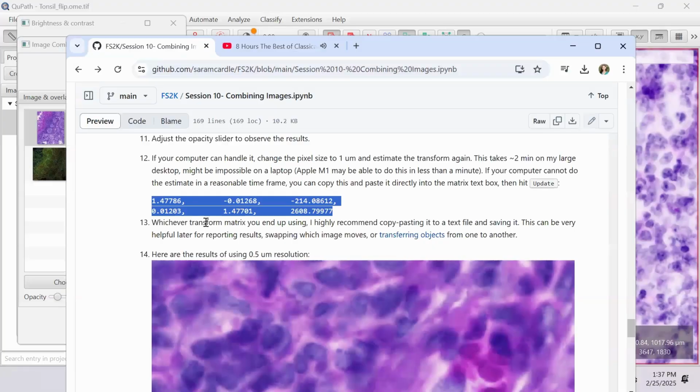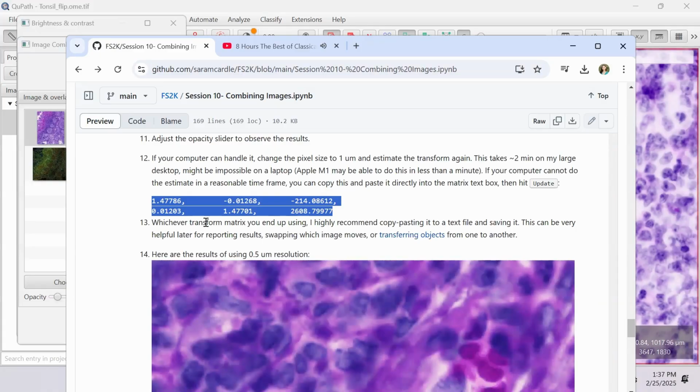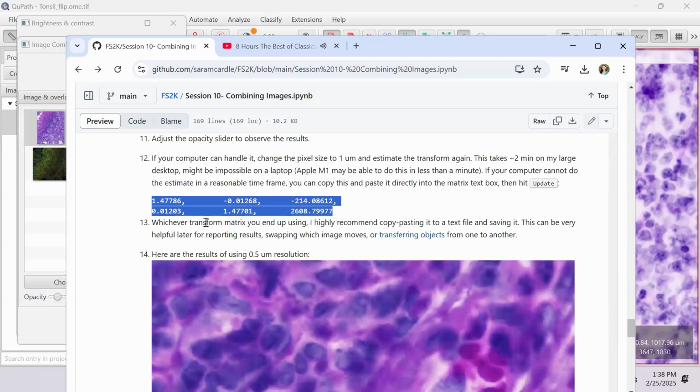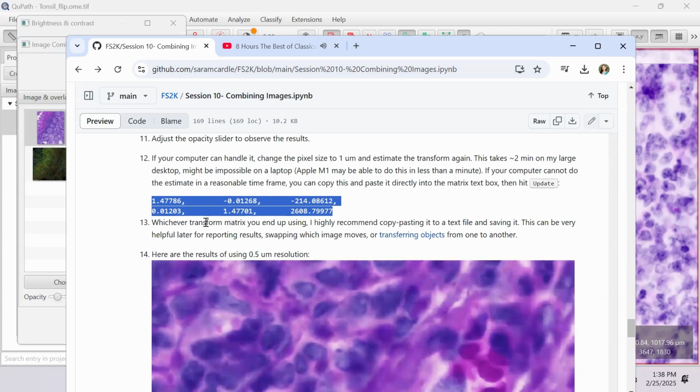Would you see that you could manually put a small bit to make it even better? So the question is whether you should resist the urge to tweak it manually. And the answer is yes, you should resist the urge to tweak it manually, because what you're going to be doing is affecting translation, but you're not going to be affecting rotation or other elastic changes in the file.